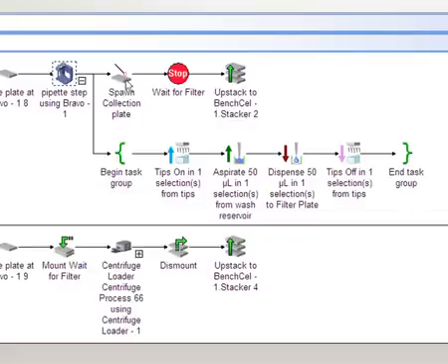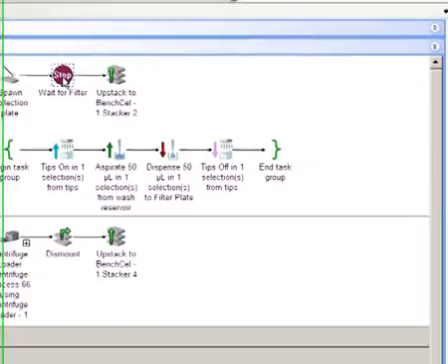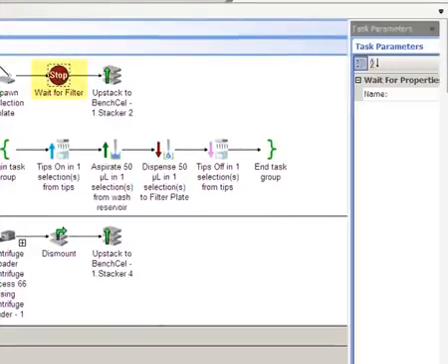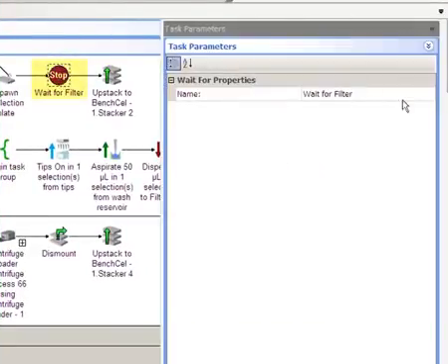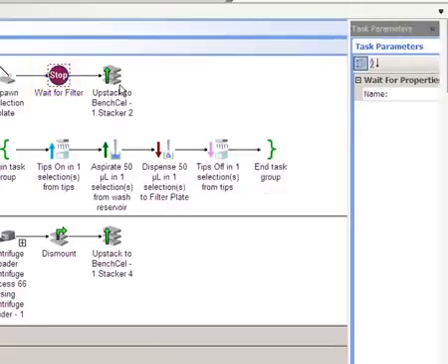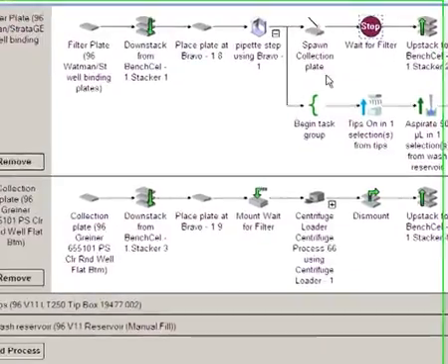At the end of the liquid handling routine, the collection plate process is spawned. The filter plate has to wait until the collection plate is ready. Notice that when I added the wait for task, I named it wait for filter. The name helps me identify and reference the correct Labware process later on. I'll show you that in a minute. When the filter plate is finished, it returns to the specified bench cell stacker.